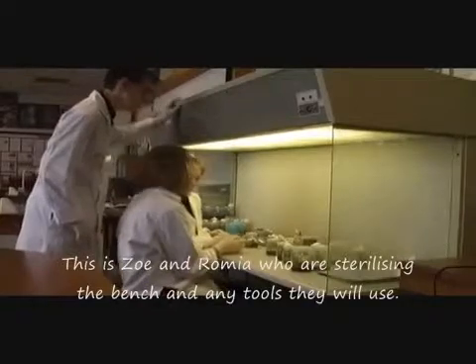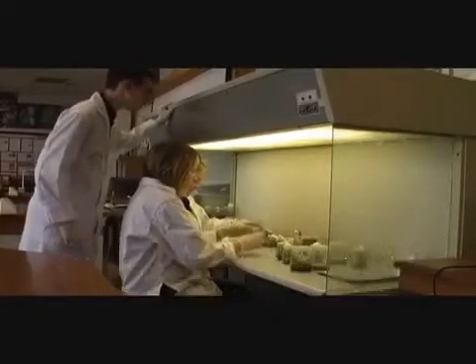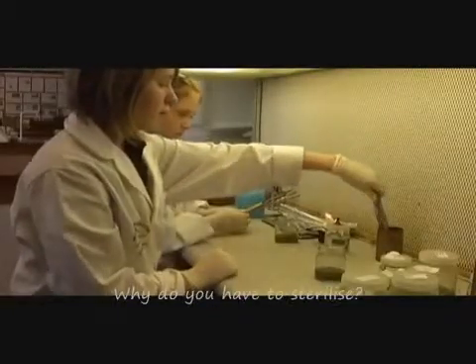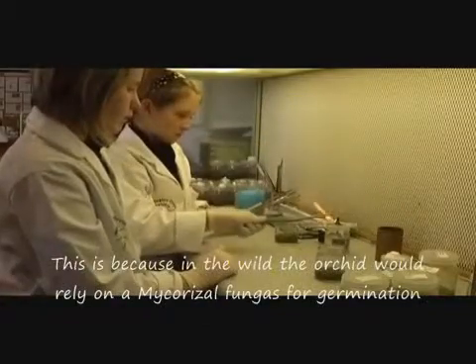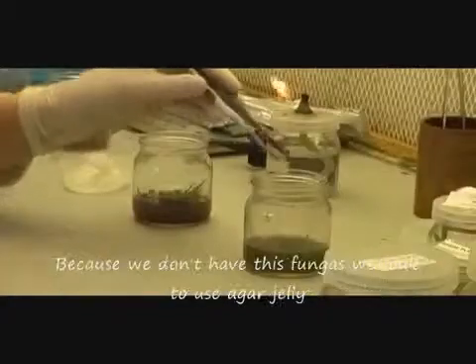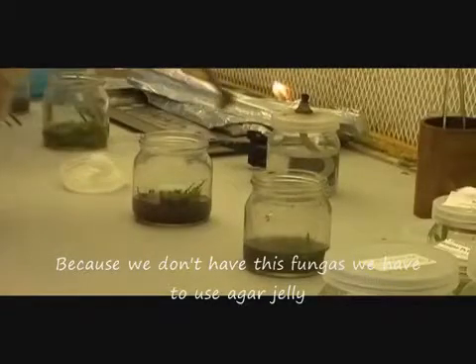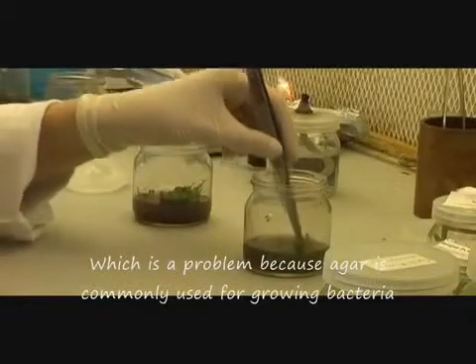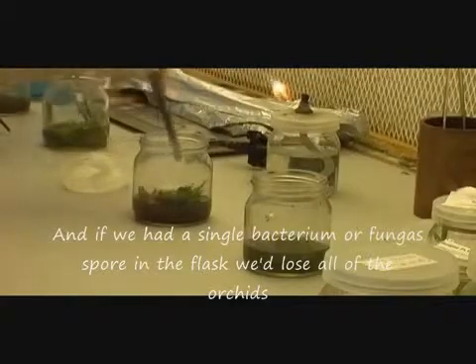So here we have Zoe and Ramia who are sterilizing the bench and any tools that they'll use ready to do the replating. Why do you have to sterilize everything? Well we sterilize everything because in the wild the orchids would rely on a mycorrhizal fungus to give them the glucose they need for germination. Because we don't have the mycorrhizal fungus we have to use agar jelly, which is a problem because agar is commonly used to grow bacteria. And if we had a single bacterium or a single fungus spore we'd lose the whole jar.